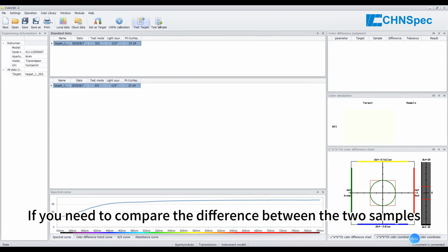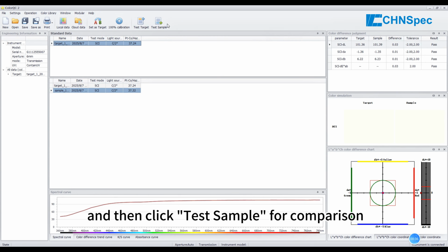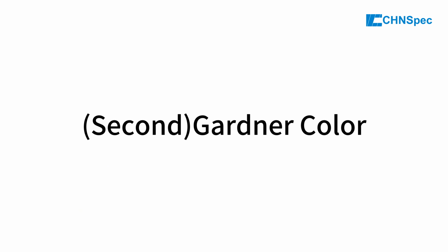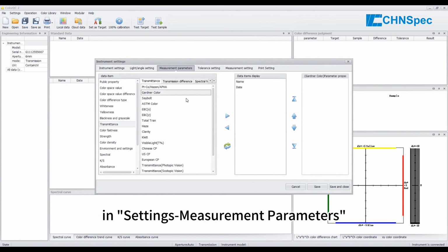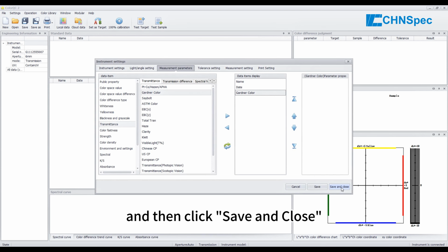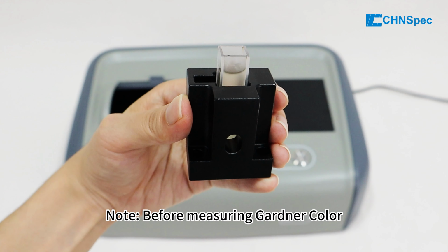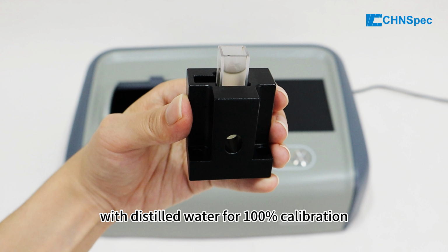If you need to compare the difference between the two samples, you can put another sample and then click Test Sample for comparison. Second, Gardner color. Select Transmission Gardner color. In Settings Measurement Parameters, click the right button to put it in Display Data Items, and then click Save and Close. Note, before measuring Gardner color, please use a 10 mm optical path cuvette filled with distilled water for 100% calibration.